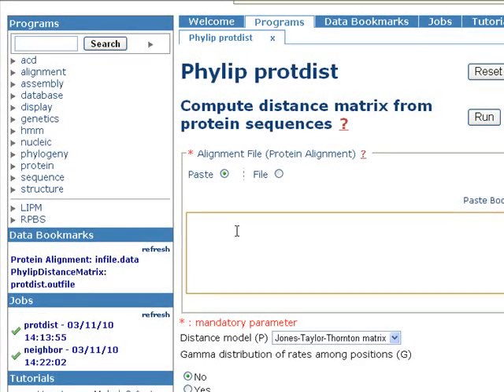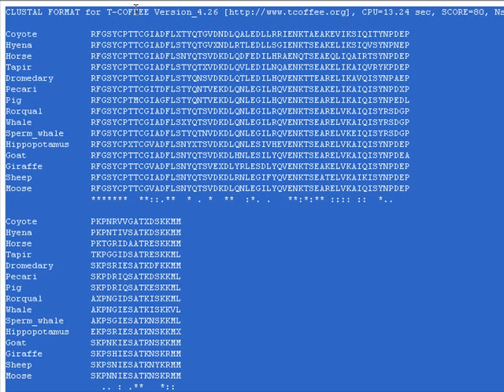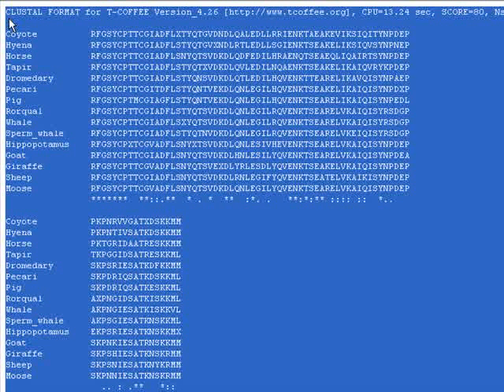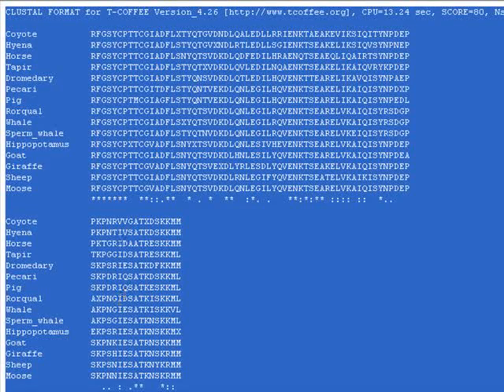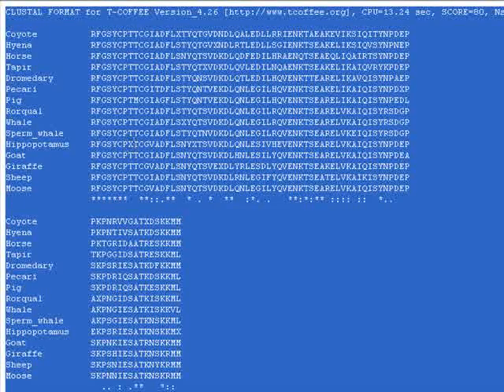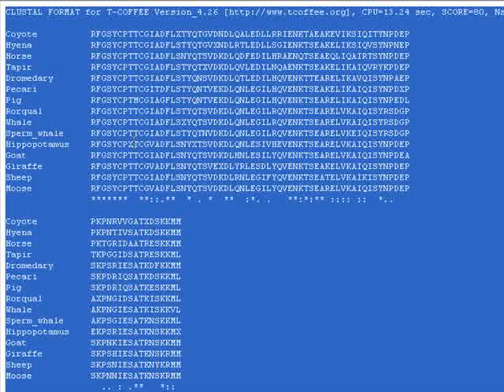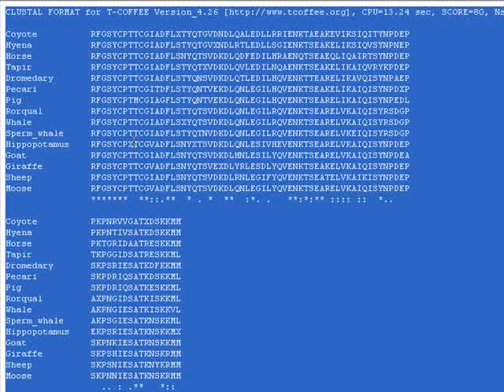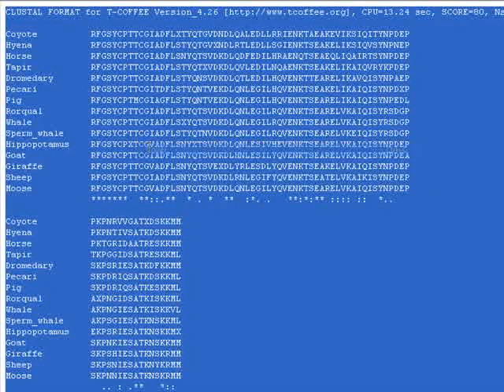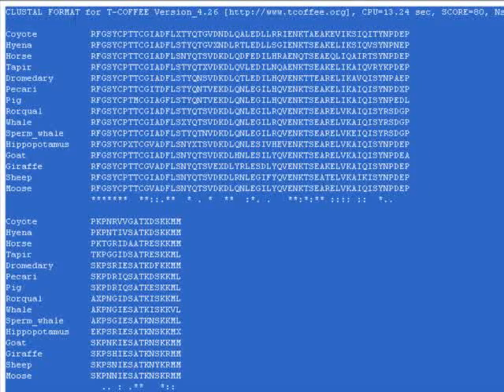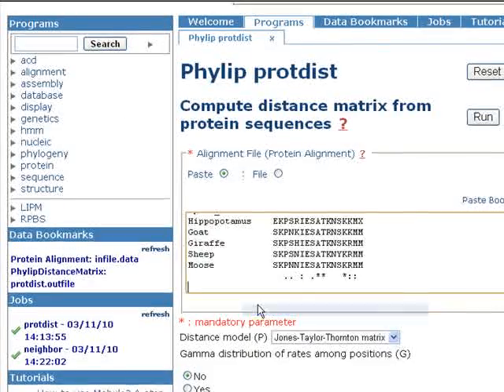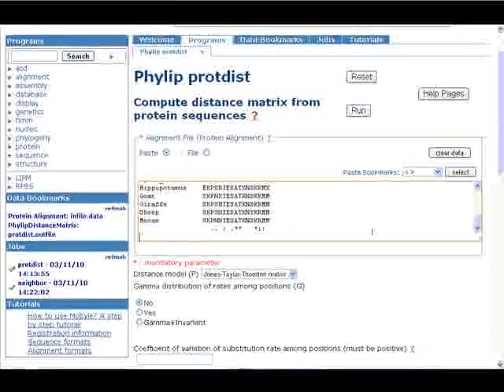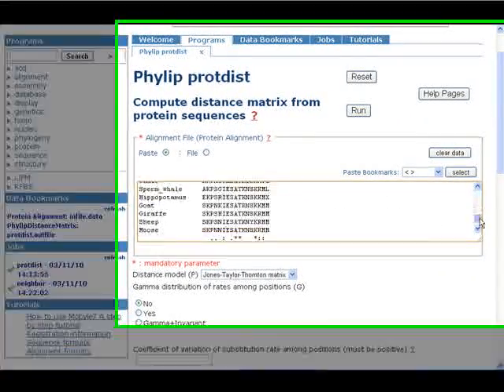Which have a test alignment at tcoffee.org. If you click this link, you'll have here a ready multiple sequence alignment that you can use to test the software. But if you have your own multiple sequence alignment, you can use it. Okay, we copy it and paste it here.